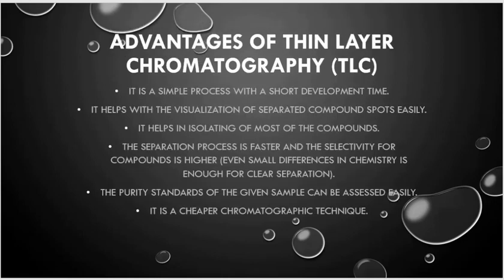Now we have the advantages of thin layer chromatography, that is, why we prefer it. Some of the advantages of TLC: it is a simple process with a short development time. It occurs in a very short time and is a very simple process. It helps with the visualization of separated compound spots easily. They can be seen easily without the use of any chemical or other compound. It helps in isolating most of the compounds; most compounds can be isolated through TLC very easily.